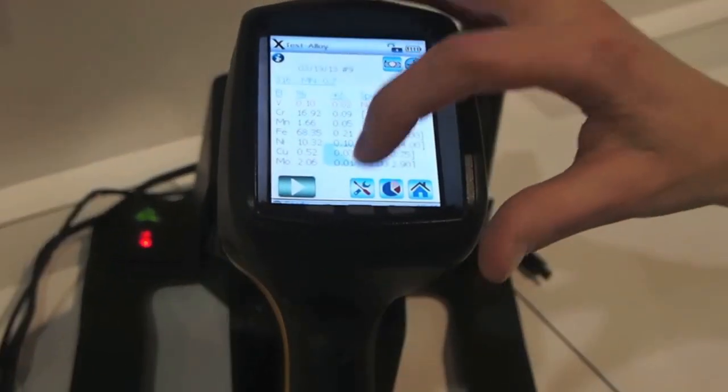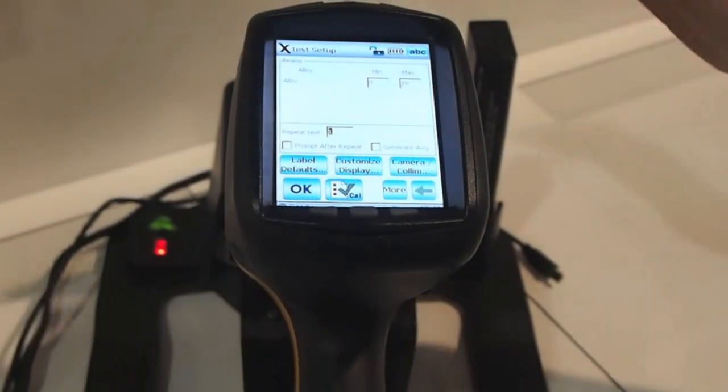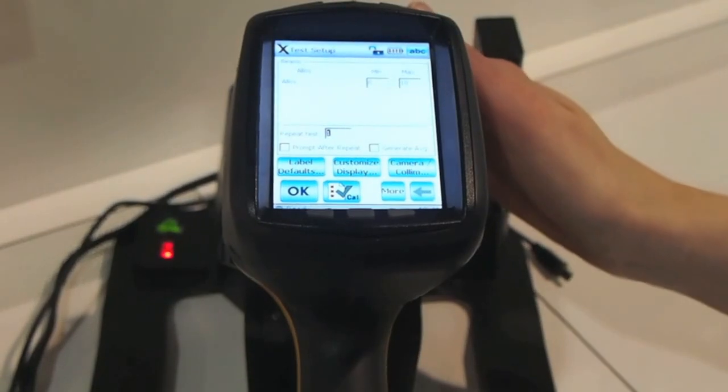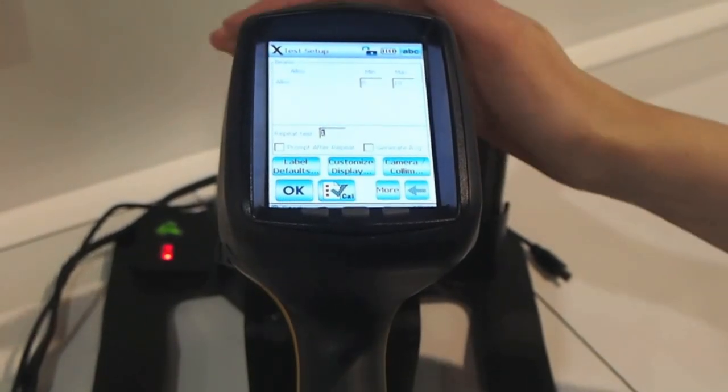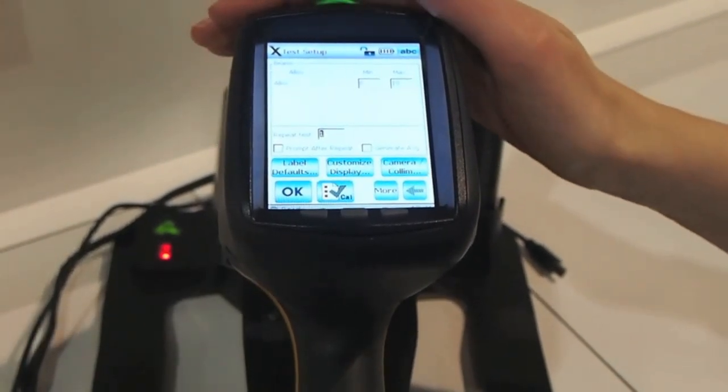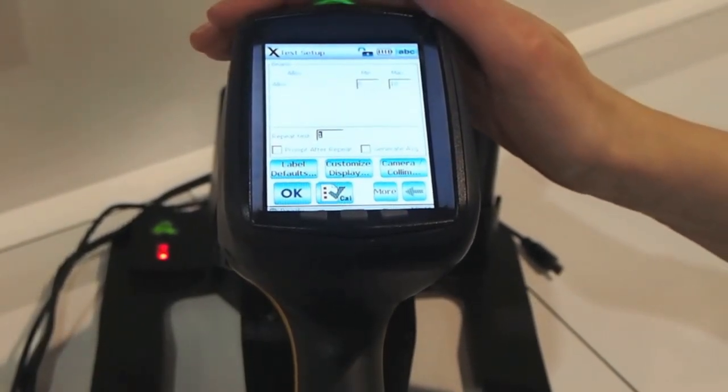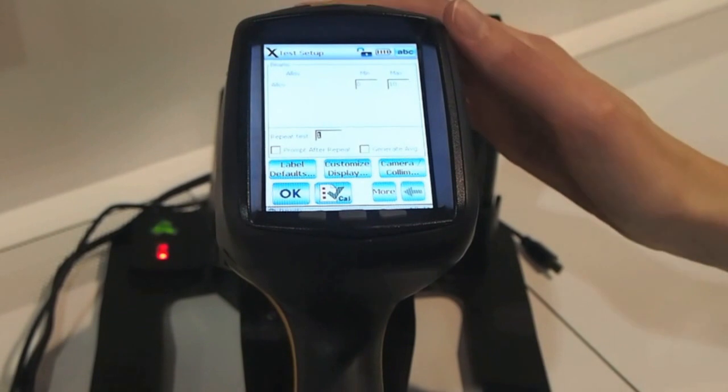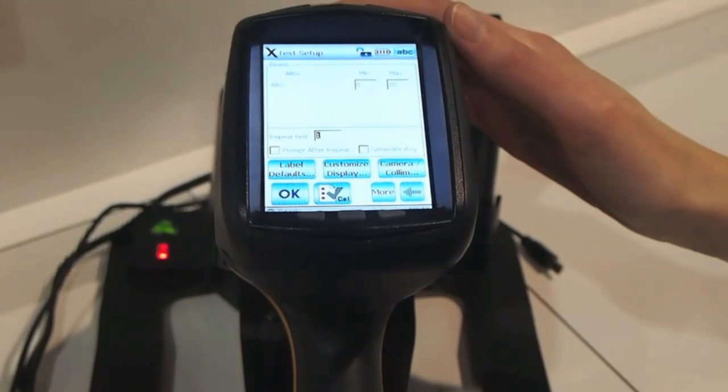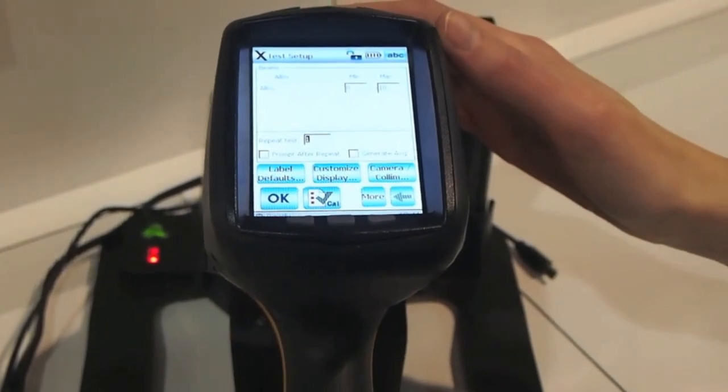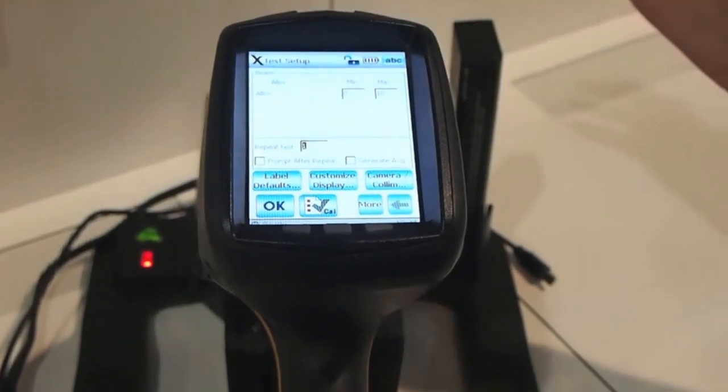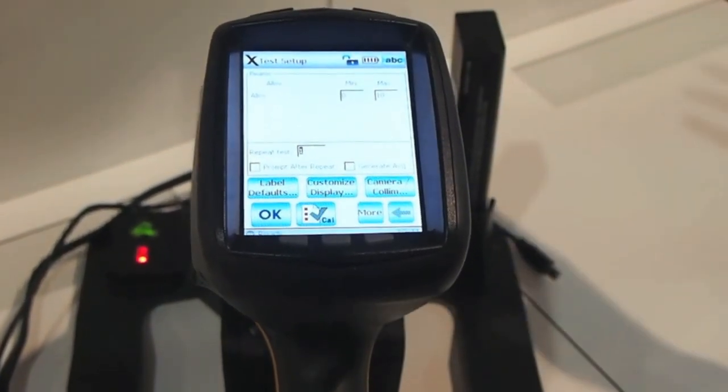If I go to some of our customizable features we can control the test time, repeat testing, labeling of tests, as well as camera setup.